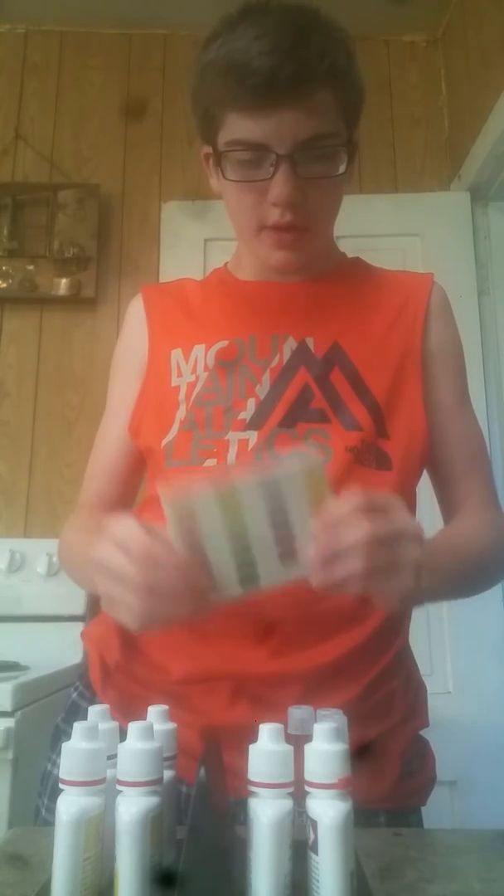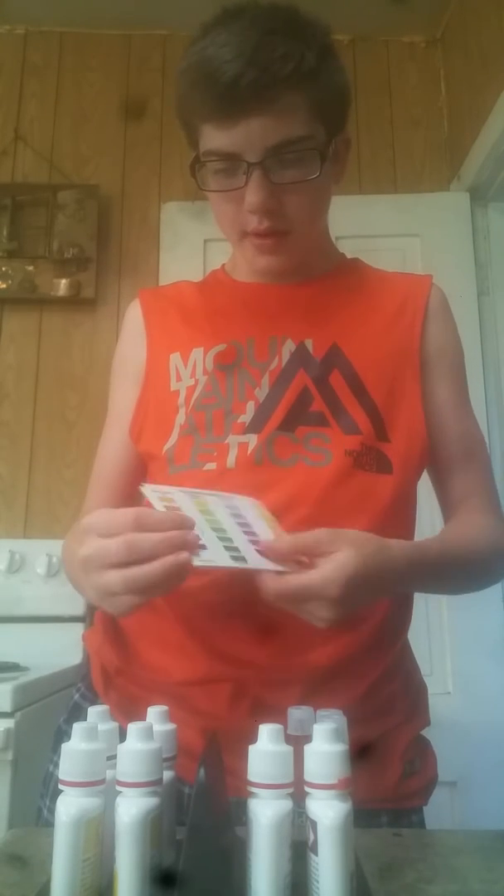I've opened it and got my camera set up. I know it's a pretty bad camera, but basically it tells you the levels that match up here. It tests high range pH, ammonia, nitrate, and nitrite. It's fast, easy, and accurate. It gives you over 550 tests.